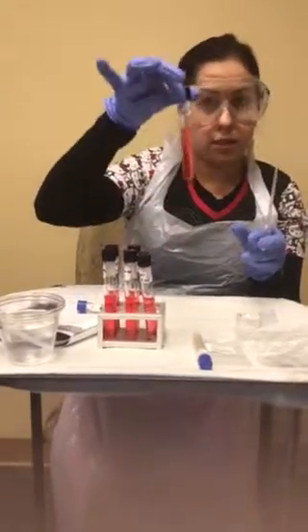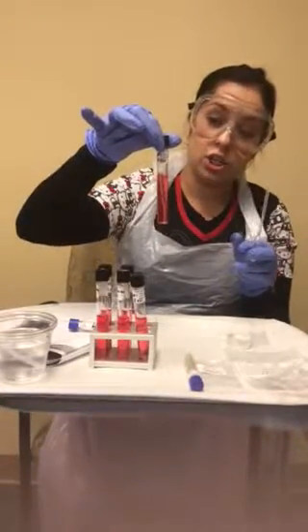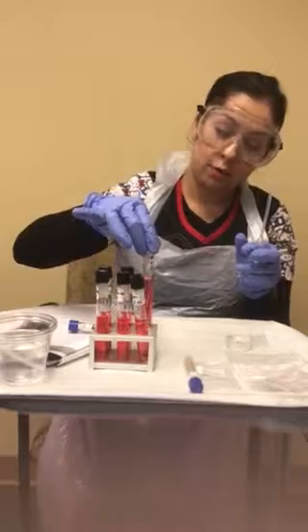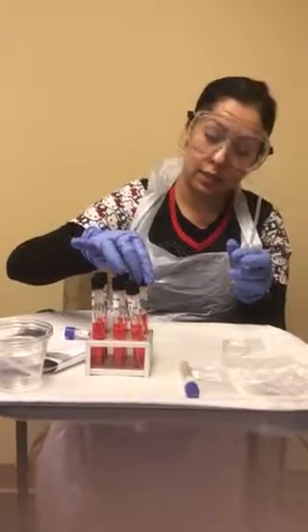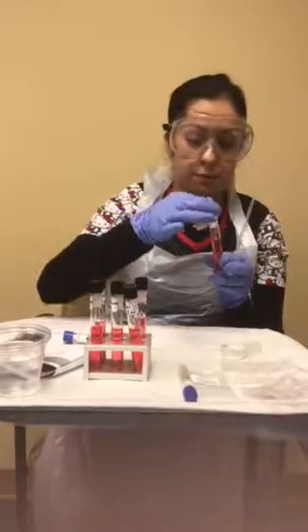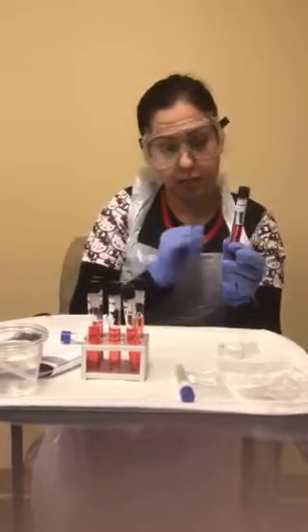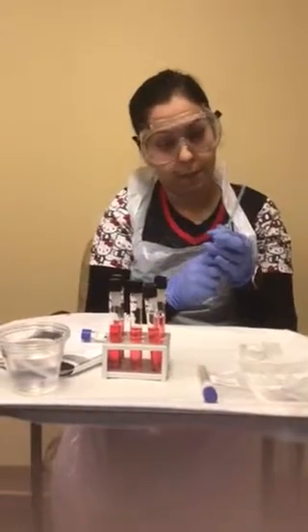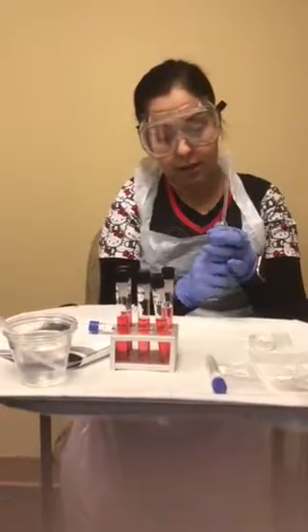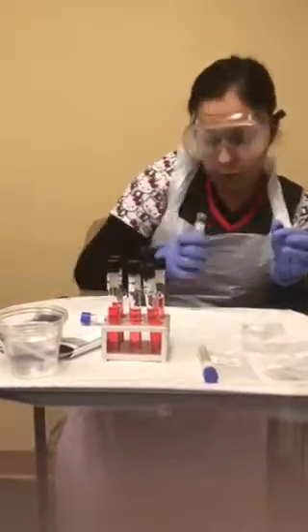I'll incubate this for 12 hours, come back and check if there's any change in color, take my photos, and upload them to my assignment sheet. I'm going to repeat the same step for the same culture — the S. cerevisiae yeast — and this time it'll be for the fructose powder.